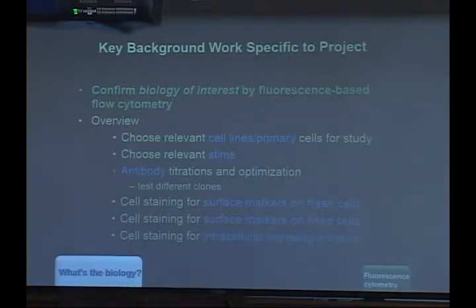And yes, I just want to tell you, the buffer conditions and all these conditions do affect the recognition of your epitopes by the antibodies, because a lot of these things are denaturing. Freezing is denaturing, paraformaldehyde is denaturing, but you can't have a perfect condition for every antibody. So at the end of the day, the panel and how you choose to work on it is the result of compromises. You might have to take a few hits, not usually too terrible, but it is about compromises.